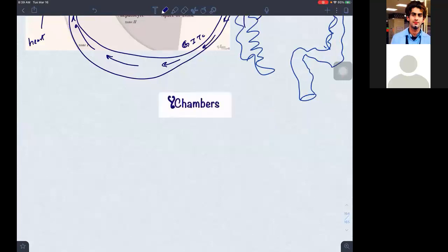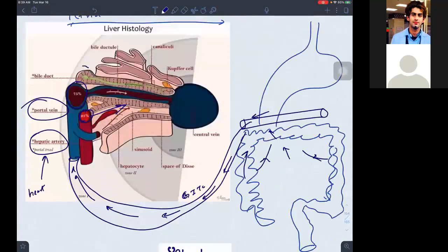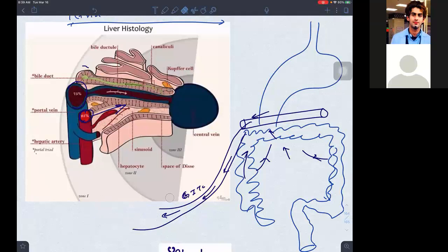Okay, so we are able to appreciate a triad. There is a triad, isn't it? Isn't it a triad on one end? Now see, please have a look. Please concentrate here. I want your full concentration, so that it's learnt once for all. We don't have to learn it again and again as being doctors.